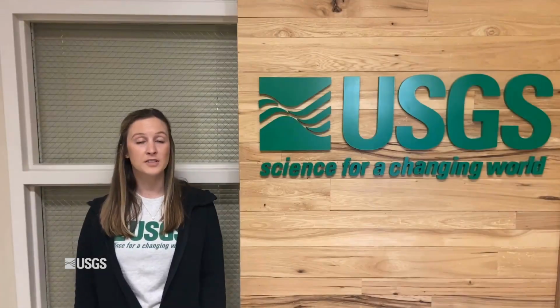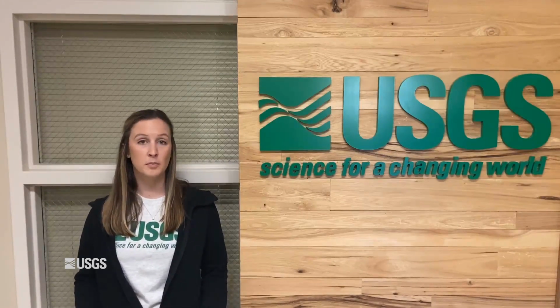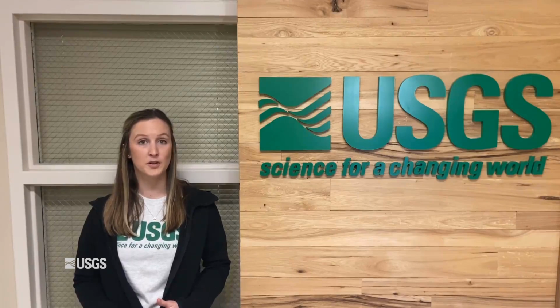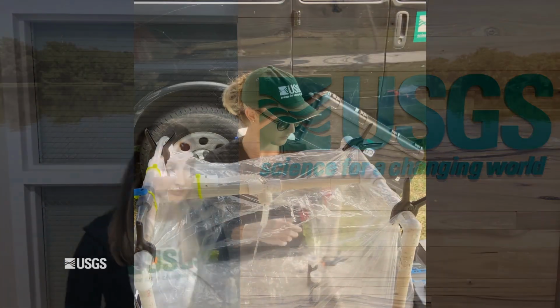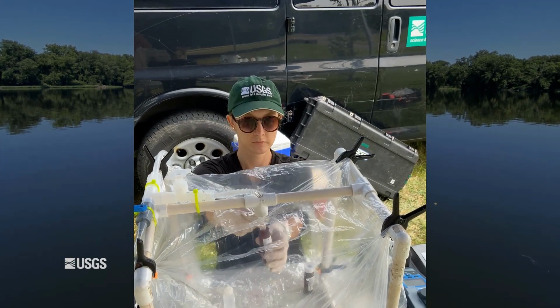Before we head back to the office, I'd like to show you a little bit of groundwater sampling. This sampling uses a pump rather than a bottle and churn like we saw in our last surface water collection video. Here's some more water quality sampling. This time we're sampling groundwater.